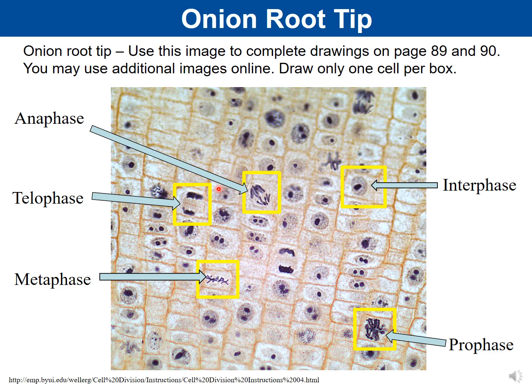And so again, you might recall that one of the things that's going to happen is that the chromosomes, when they're at opposite ends, are going to decondense. Then the nuclear envelope is going to reform. So you're starting to see less distinct chromosomes. They're starting to become more circular. And while the cell is going through telophase, it is simultaneously also going through cytokinesis. So they're occurring at the same time. So we're seeing the cell plate form at the same time that we're seeing telophase occur.